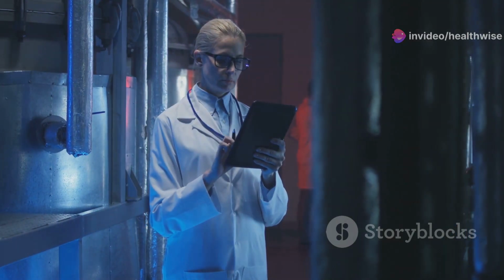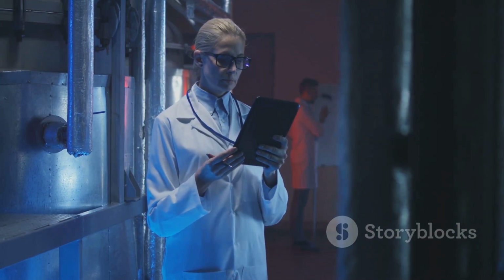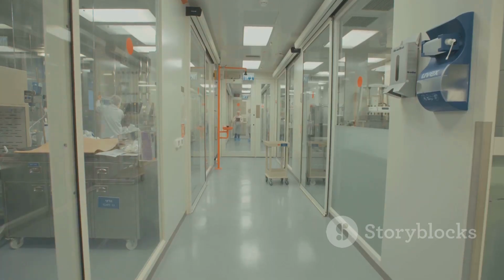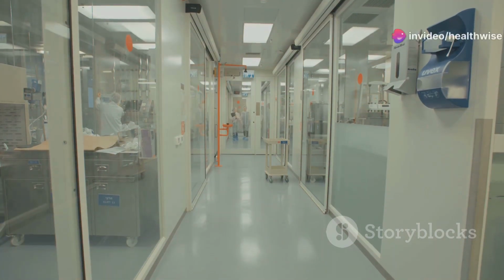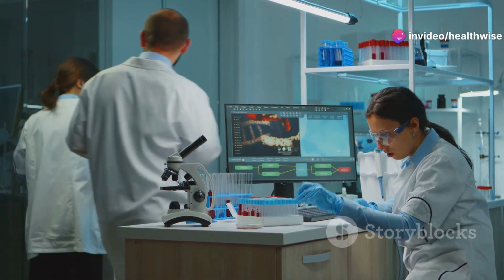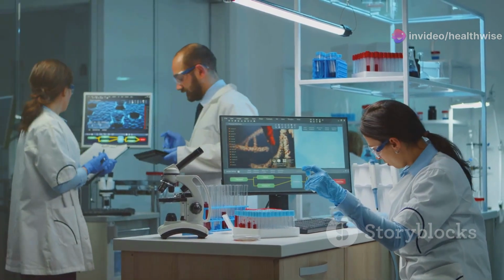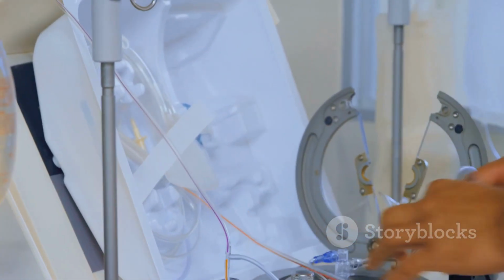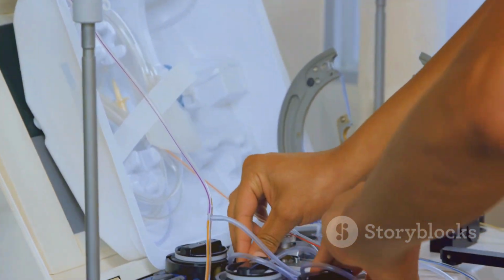By following these steps, researchers can rely on incubators for accurate and consistent results. In summary, incubators are indispensable tools in the scientific community. Their ability to create and maintain controlled environments has paved the way for numerous discoveries and innovations. Proper care and maintenance will ensure they continue to support scientific progress for years to come.